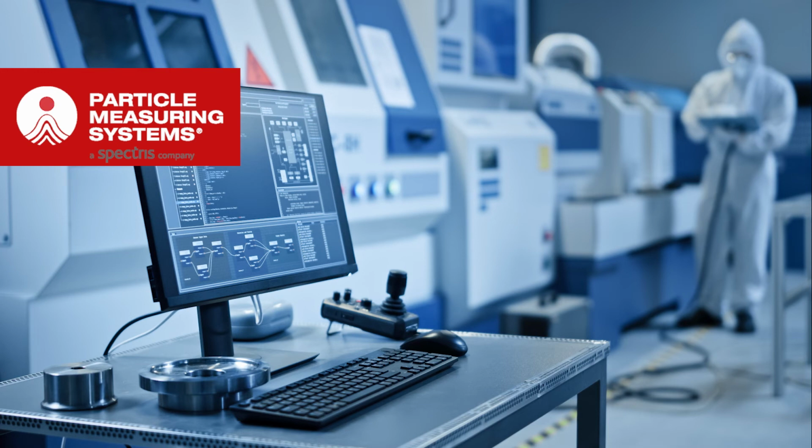Well, speaking of data, and I was probably skipping ahead, there were some other things I wanted to mention, but you mentioned data quality more so than quantity. How do you think our risk assessments support this approach? You can take an ocean of data and it's trying to bear relevancy to that data. I could go into a clean room once per month and take a sample at 30 locations, but the data from one location 30 times over the month may well give me a better impression as to what I'm looking for. And our risk assessment identifies that difference.